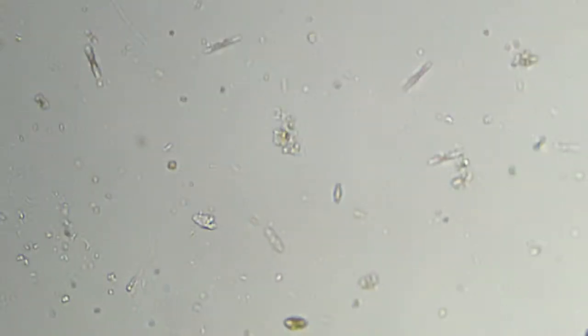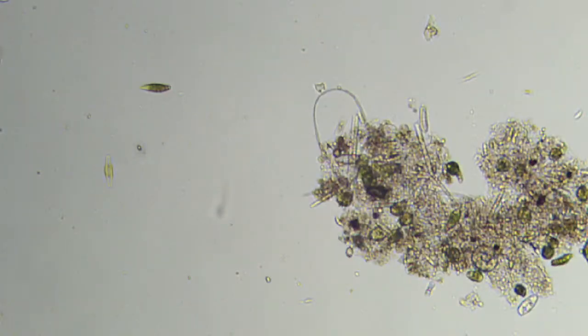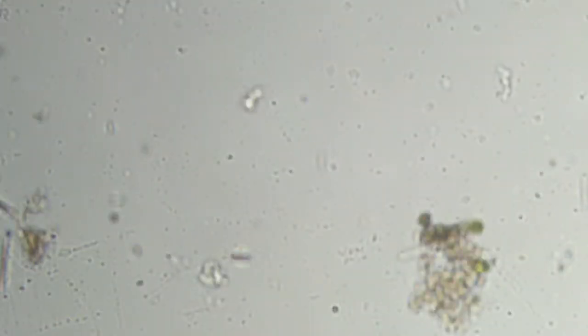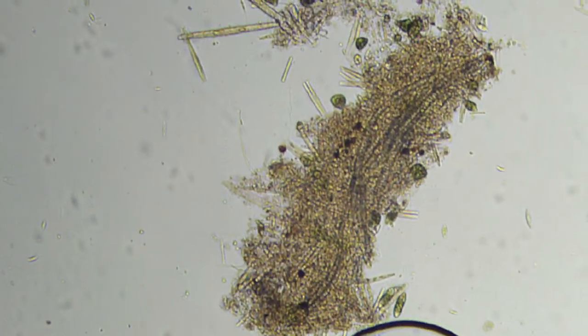This is normal bright field or white field view. Nothing special. No oblique lighting. No dark field. The way I looked at most stuff for years before I knew any better. Clusters of diatoms. Look at that spiky structure sticking out of all the debris. More Euglena.